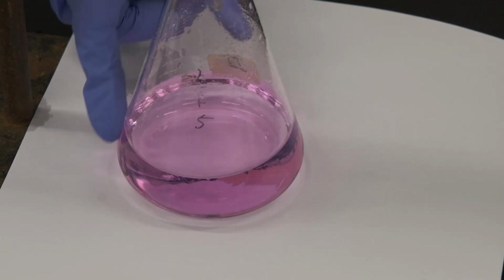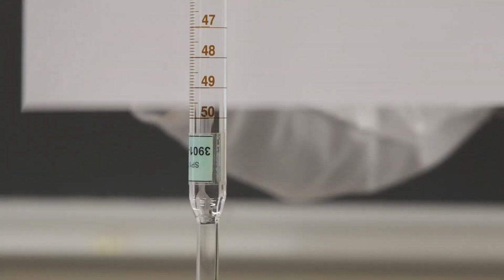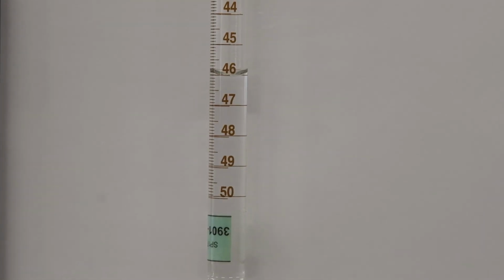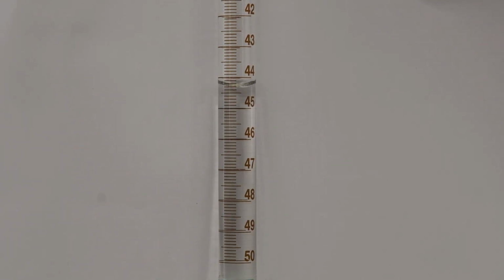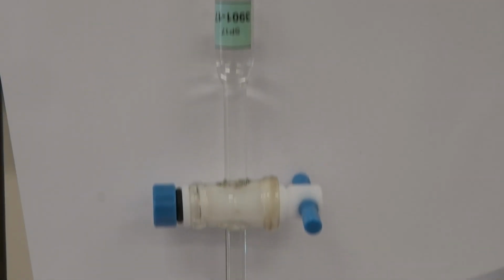Now that the solution's turned pink, we're going to read the final reading on the burette. That's a good one. This is the final reading of the burette for trial 2, after adding sodium hydroxide solution to the oxalic acid solution.